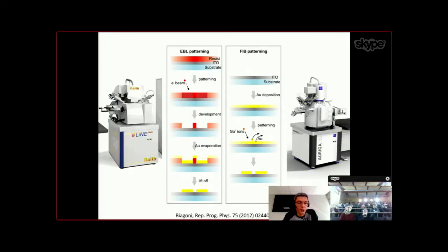Okay, and finally, a word about nanofabrication, because this is also something that is important. I will show you various examples of nanofabrication using a bottom-up approach and top-down. So bottom-up is you use nanoparticles that are synthesized by colloidal chemistry. So you can buy them and apply them directly on your substrate. So this is some easy way. Another approach, which is more regarding towards nanofabrication technology, is the top-down. Top-down is going to mill the nanostructures on the glass system.